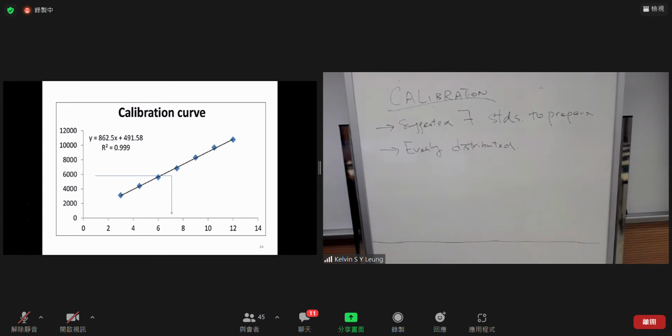And ideally and normally we will have this kind of curve that can be obtained after having the measurements with those 7 standards with the signals that you obtained, okay. So if it appears to have a linear relation, these test results will have appropriate statistical methods, okay.